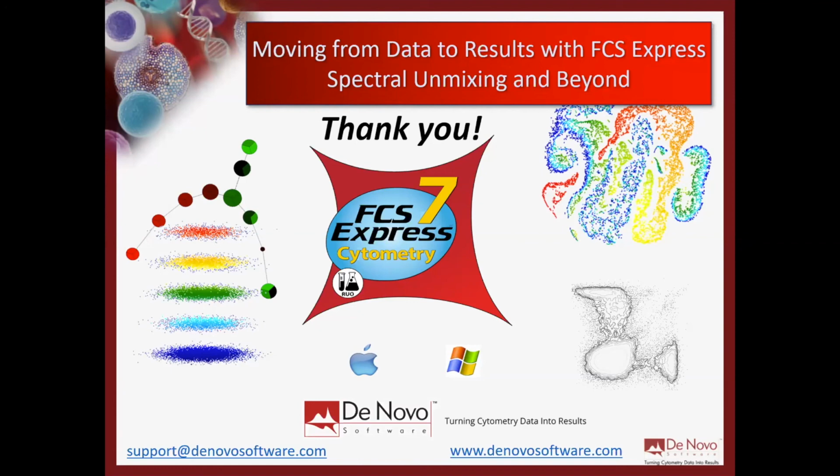Okay. And then we had some questions from the chat, so I'm going to go back and forth. Rohit had asked, is the algorithm of spectral unmixing similar or dissimilar to Sony or Cytek? And then their follow-up question was for MFI, how is it calculated using only the highest emission channels, or the whole spectrum?